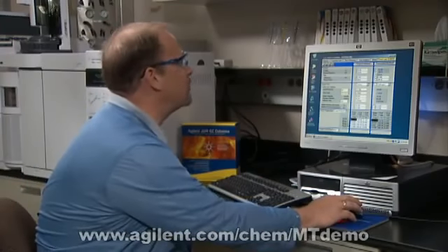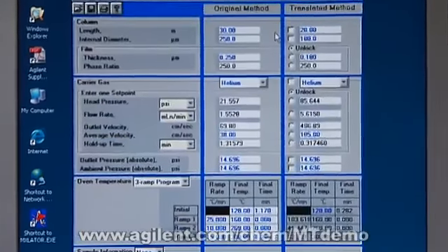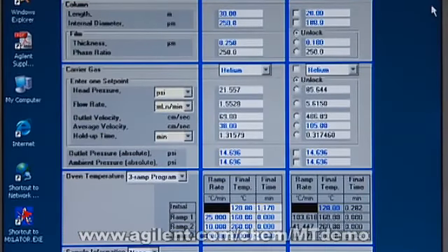I saved that screen just to show you how it worked. So here it is right here. Now they're doing what they used to do in 30 minutes in just over 4 minutes. So in a routine analysis, they can do 6 times as many samples as they used to do in the same time frame.